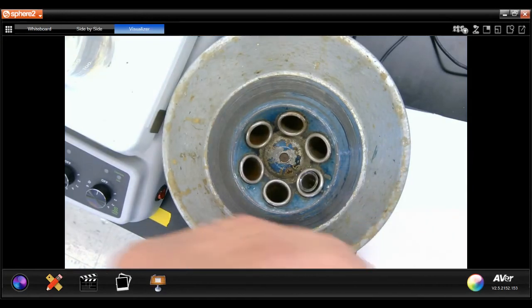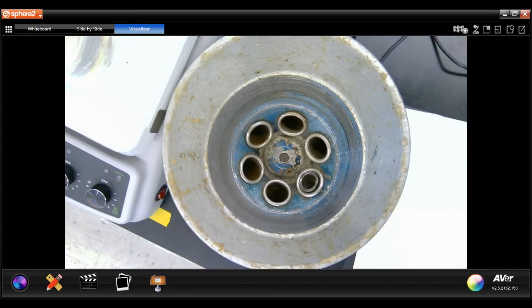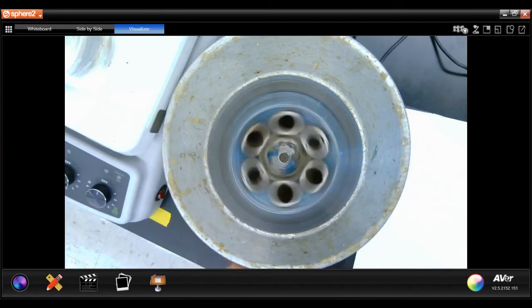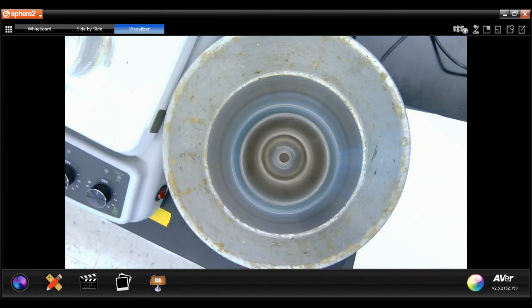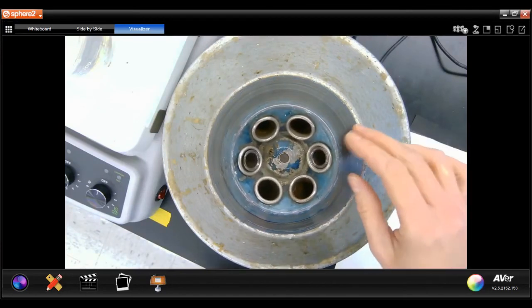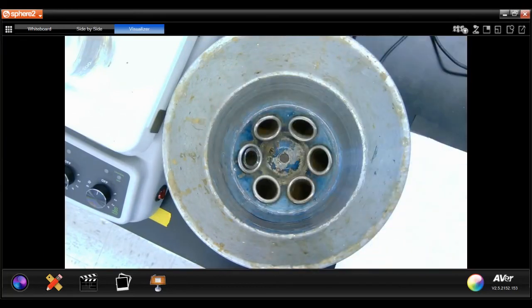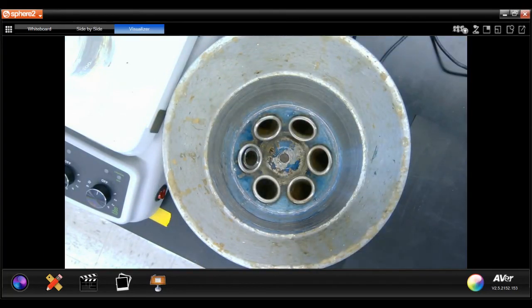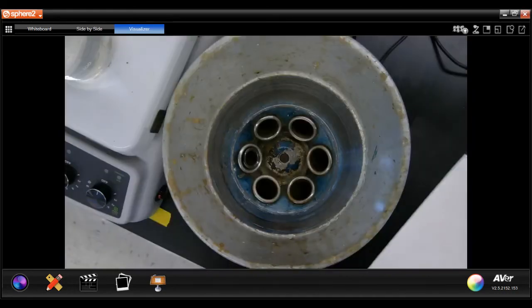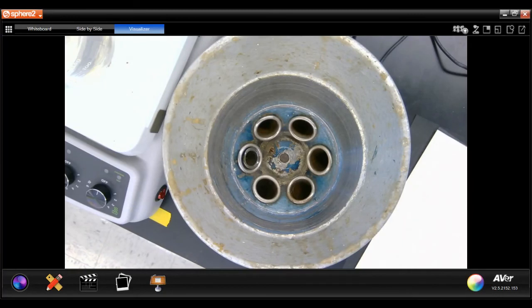I'm going to centrifuge that again. After centrifuging with the wash water, the final step here is I'm going to decant away the wash water and save this precipitant that's at the bottom. I'm going to save that for step number three.